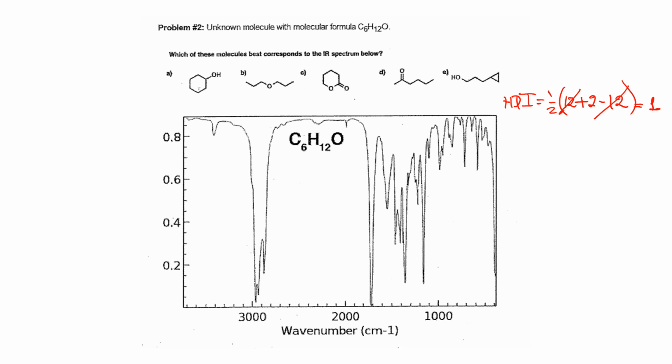What you see here is that all of those bands are right under 3000, and I have this intense band precisely at 1700. Notice this is 2000, 1900, 1800, 1700. That is typical of a carbonyl bond. And so we have these elements: 1 unsaturation and 1 carbonyl.